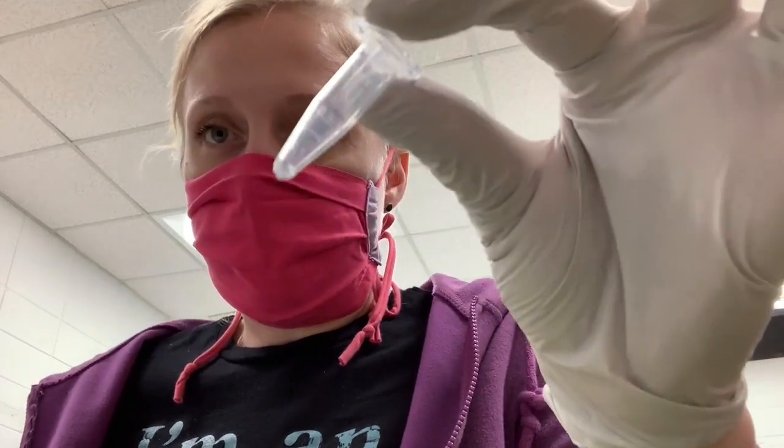And so with that, we'll finish. That finishes our DNA Clean and Concentrator purification. And you could use this, as I said, for many downstream applications: for cloning, if you're purifying a vector, and for riboprobe and double-stranded RNA synthesis, if this is a hot start PCR that's been generated for that purpose.